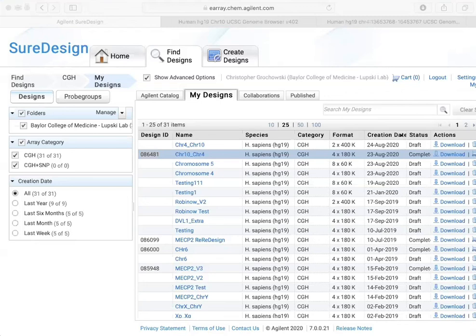I would probably recommend a 4 by, because then you can do it all in one shot and save that array, especially if it's chromosome 4 and chromosome 10, because we have neither of those in the lab. If anyone ever needs to check chromosome 4 or 10 again, you could say, I already have this array, you just need to strip it.